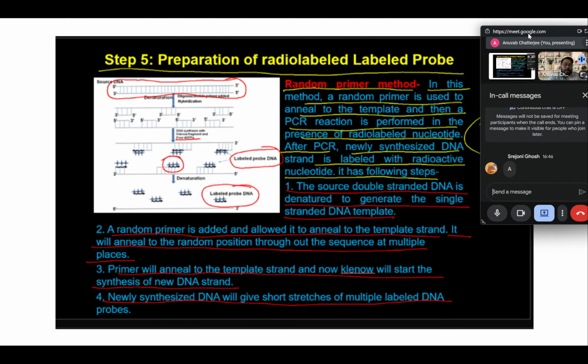As we have been saying, you use probes to detect the RNA that you have on the gel. It is a very similar process to how we do southern blotting.